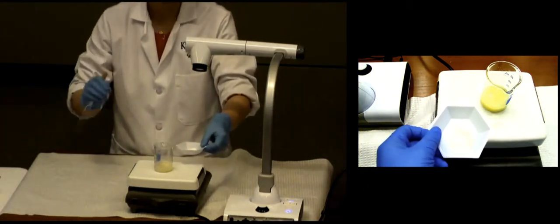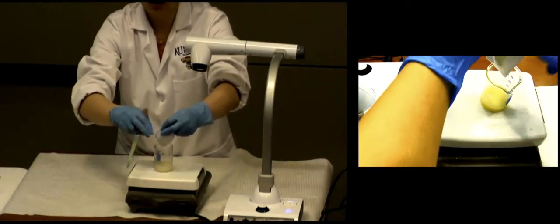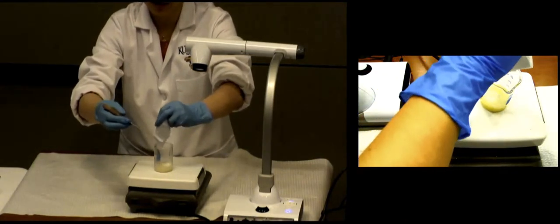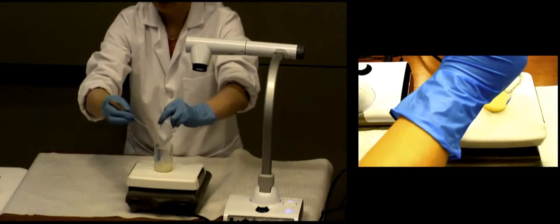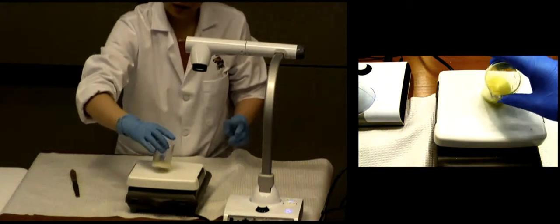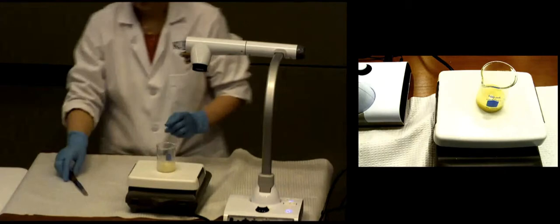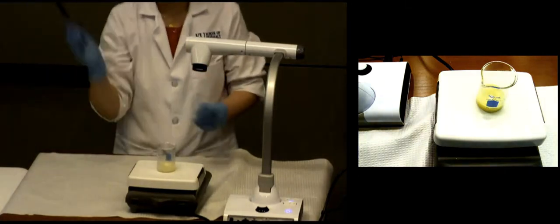Alright, so the sift has a little bit of powder which goes through the sift. So we're going to add that part into the base as well. Okay, and then I realize I still have a little bit on my stir bar. Okay, so we have added all the powders in there.